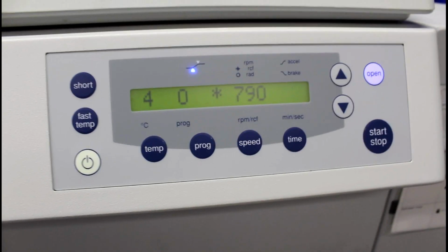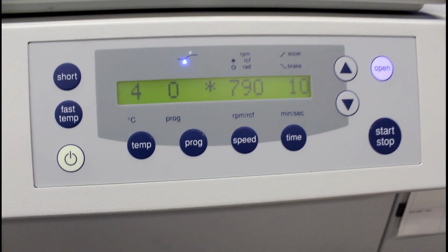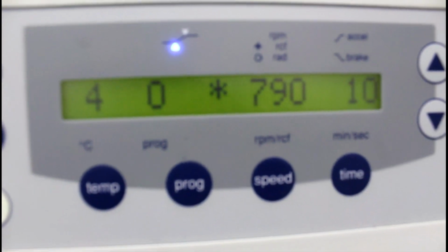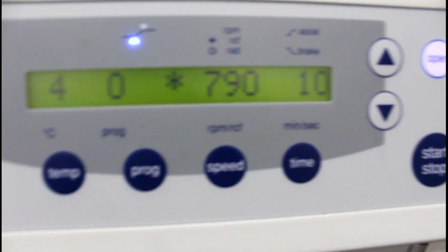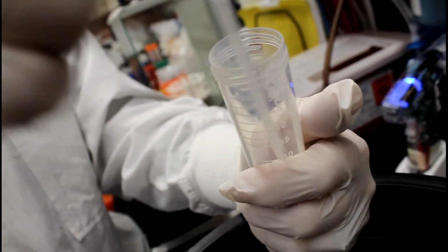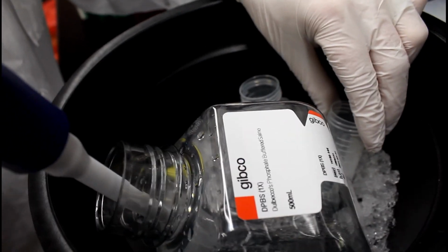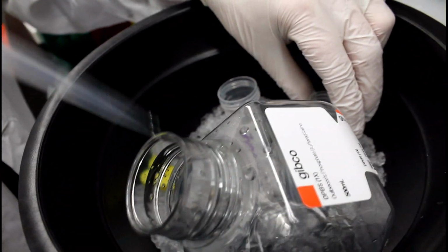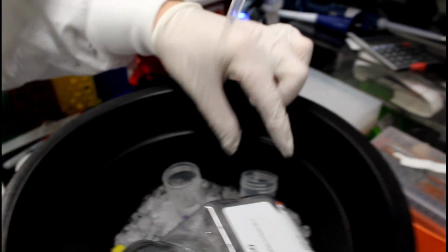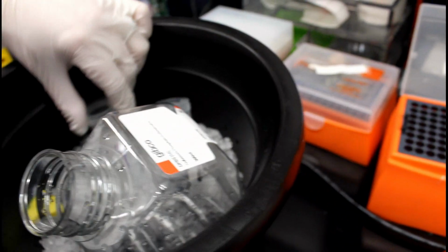The last step in the process is to prepare the cells for the extraction of RNA. From the remaining cell suspension, spin that sample down at 790 G for 10 minutes. Following centrifugation, remove the total supernatant and discard it. To the cell pellet, you will add 500 microliters of cold DPBS and 500 microliters of Zymo Research RNA DNA Shield.